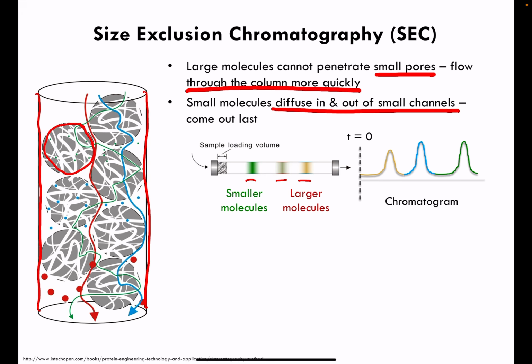So to help this, we're going to set the solvent conditions very carefully, and the sample will be dissolved for this study, and solvent will be constantly pushing an injection volume of the sample already dissolved in that same solvent, and we'll be pushing that solvent through and monitoring the elution as solvent and macromolecules, polymers, come out of the pipe. So in that regard, we can see here the input to the pipe and the exit for the pipe.